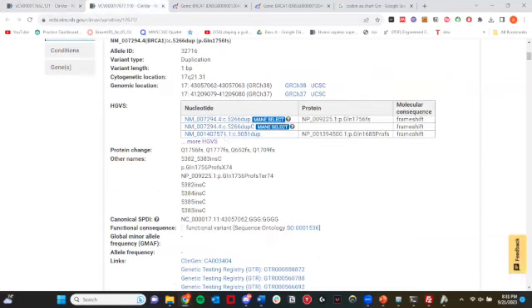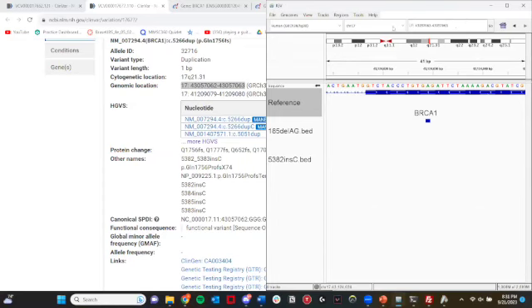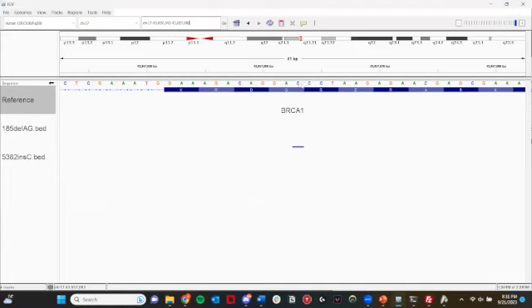Result of insertion. You want me to talk about it? Yeah. So with the insertion, same thing. I guess this one's not as bad, but it's still bad because of the range of mutation. This is pretty close to a 3' UTR. So right here, you would have CAG, which codes for glutamine, but since you're adding a C at this position, which is 63, this would change your frame again. And just after the insertion, everything is also screwed up.